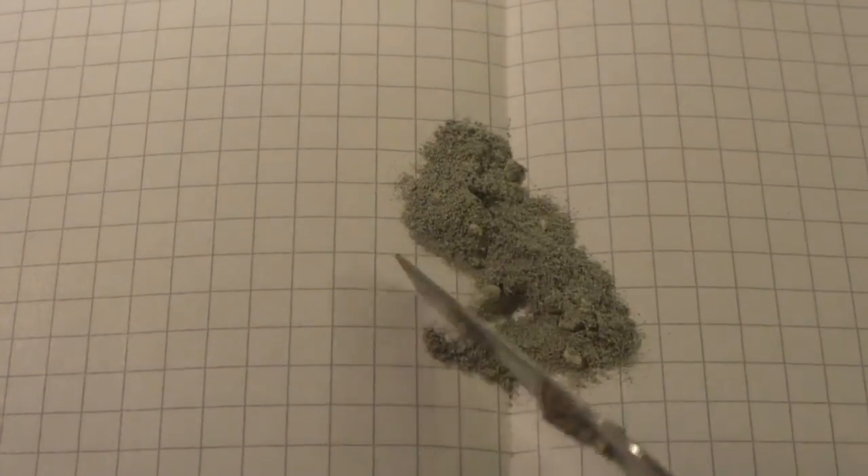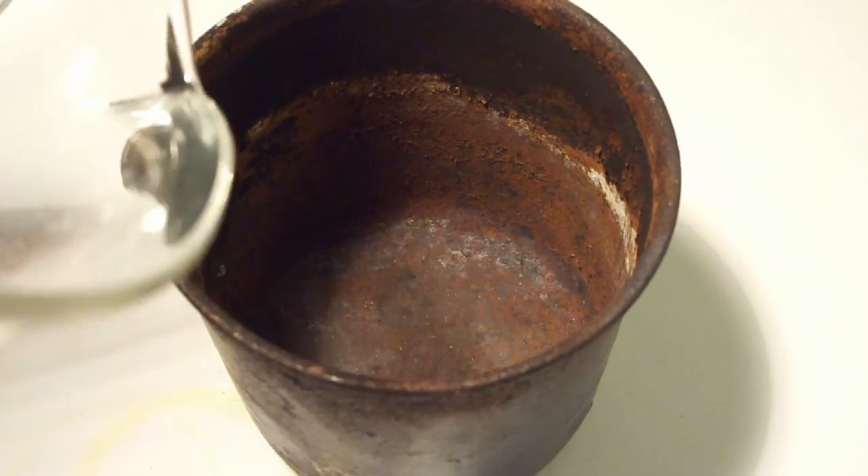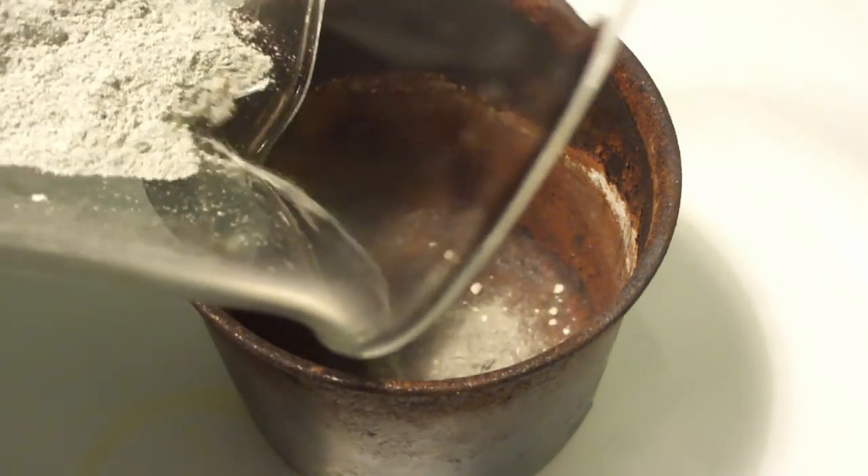The mixture should now look like this. Now we charge our intimate mixture of iron and sulfur into a stainless reaction vessel. Probably not so stainless anymore.